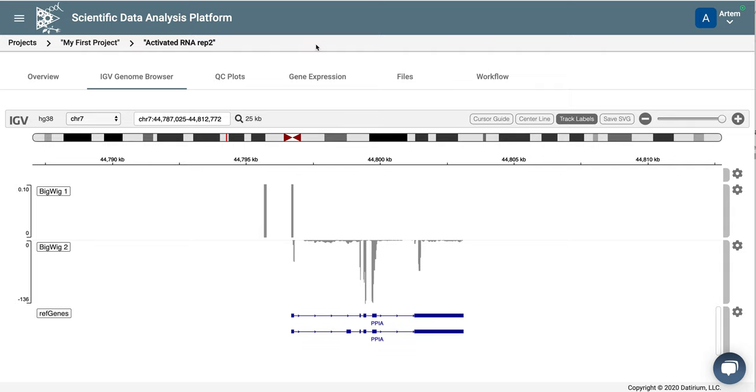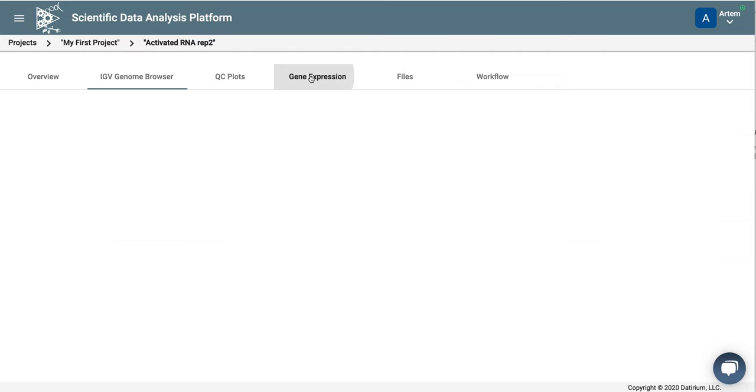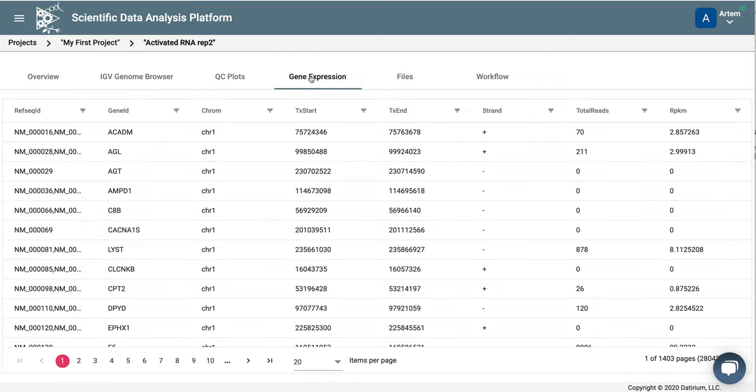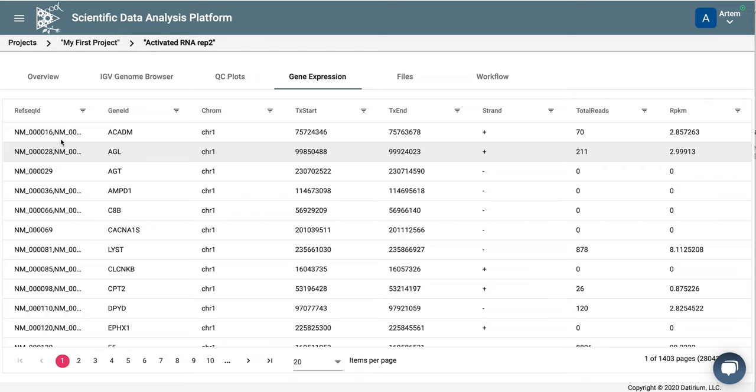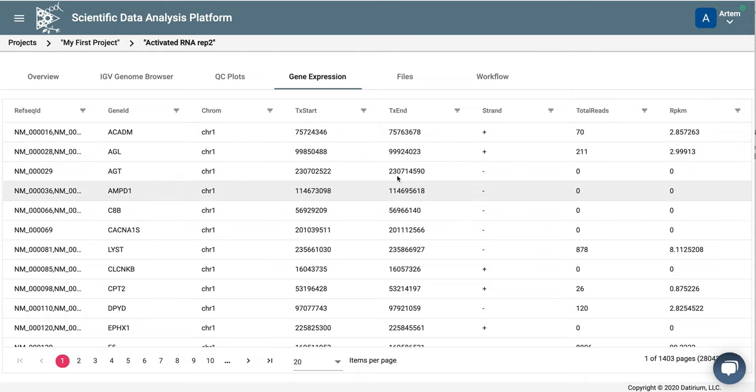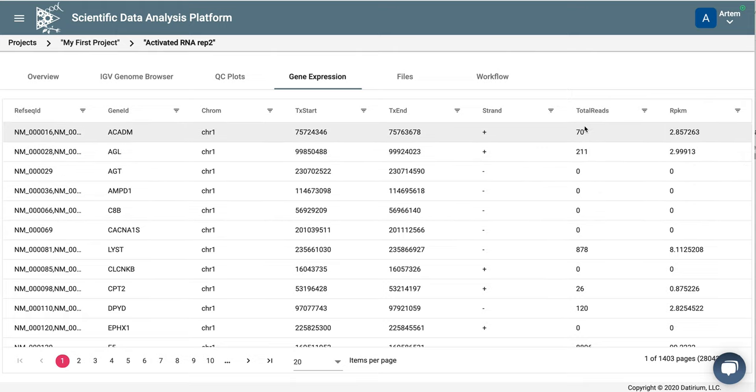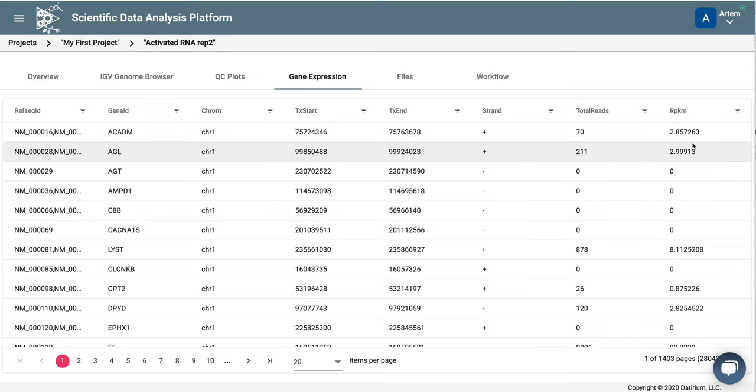What else do we have? We also have gene expression values. And here, for each gene, we have a RefSeq ID, its coordinates and strand, as well as the number of reads and RPKMs, reads per kilobase per million mapped reads, which are assigned to this gene.